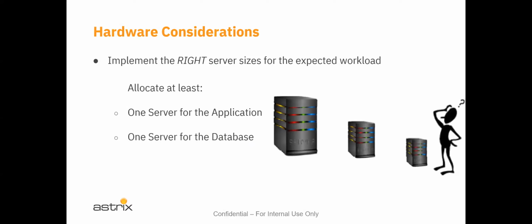So at some point, even one big powerful application server requires multiple instances of additional servers to be installed and created, and the traffic needs to be managed by a load balancer. I talked a little bit about that before, and you might run into those more often in the next trainings, and you also might run into this quite often in the clients that are starting to come on board with STARLIMS V12 systems. You should know that load balancing is not something you're going to have to manage.